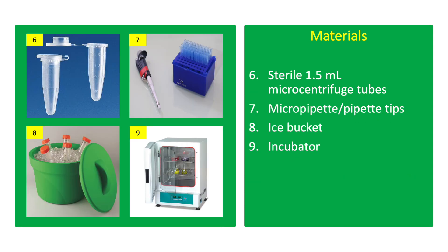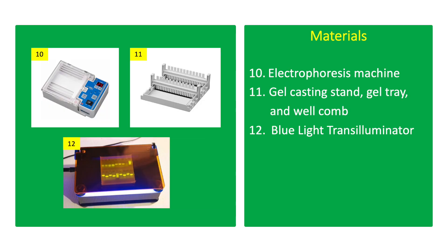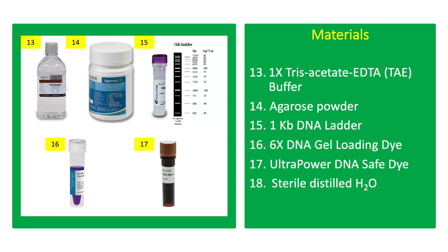Additional materials include 0.1% bovine serum albumin, sterile 1.5 ml microcentrifuge tubes, micropipettes and pipette tips, ice bucket, incubator, gel electrophoresis machine, gel casting stand, gel tray and well comb, blue light transilluminator, 1X TAE buffer, 1 KB DNA ladder, 6X DNA gel loading dye, Ultra Power DNA safe dye, and sterile distilled water.